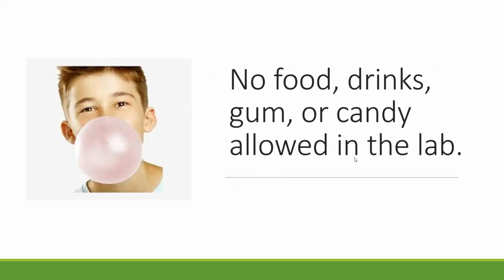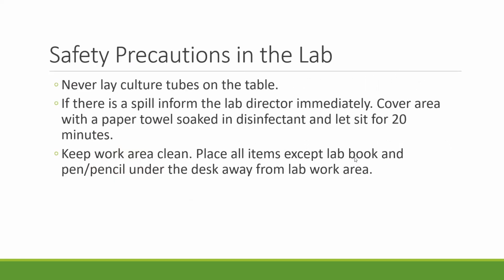In a lab setting too, it's always important to understand that you cannot have any kinds of foods or drinks in a lab. That includes gums and candies. They are just not allowed. That helps prevent contamination and keeps everyone safe. So if you were walking into a lab on campus and you had a drink in hand, the professor's going to tell you to either throw it out, go put it back in your car, or step it out into maybe a safe space in the hall, etc.